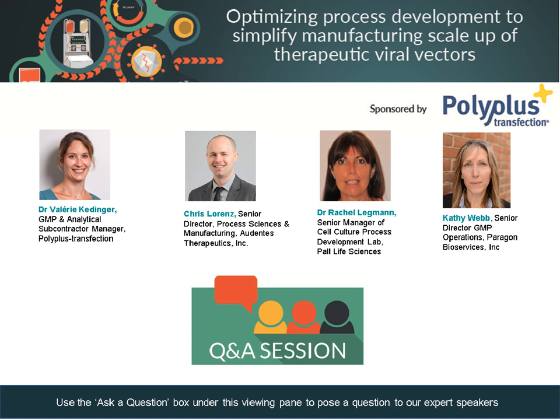They also may have a preference in terms of the platform in which they envision their program. And there's quite a difference in the hardware in terms of the suspension bioreactors versus the adherent systems. But there are options out there, which is great. But again, I think a large part of it depends upon the client as to where they see their program going in the future. And then sometimes there is also that time constraint in terms of how much time they want to invest or have the time to invest in looking at options.